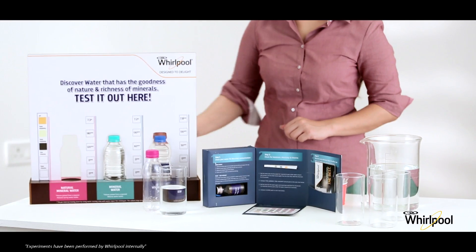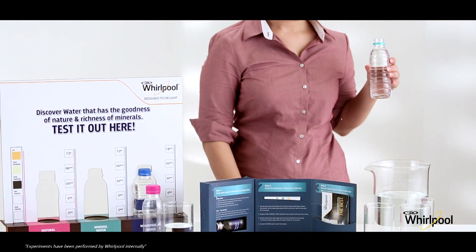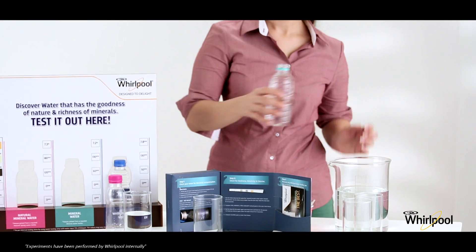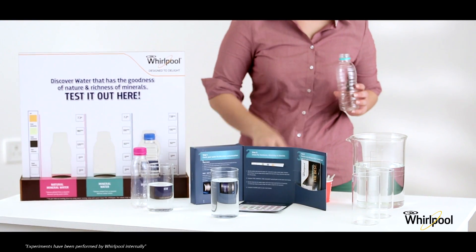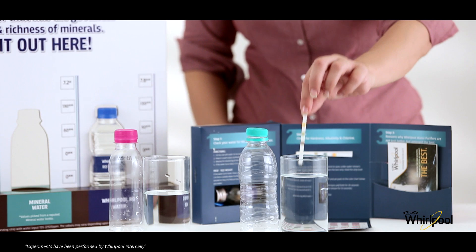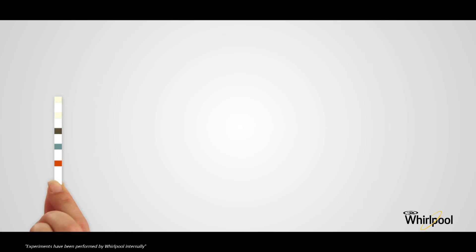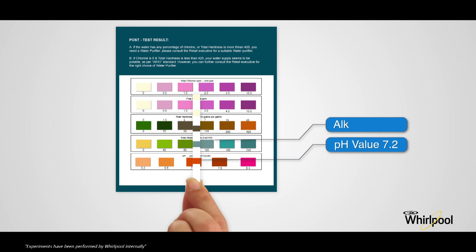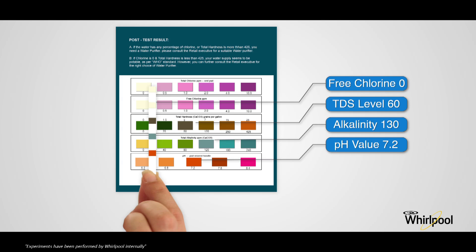Next, take out the bottled water in another glass, dip the testing strip in the water, and wait for 30 seconds. Take it out and compare pH, total alkalinity, total hardness, free chlorine, and total chlorine levels.